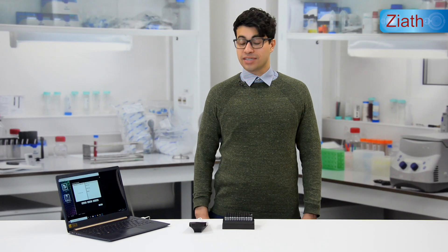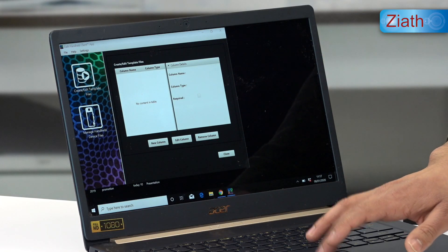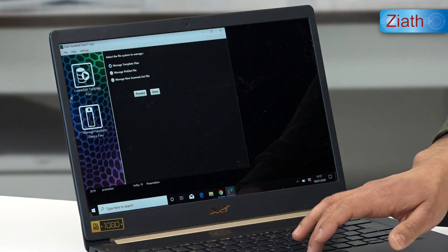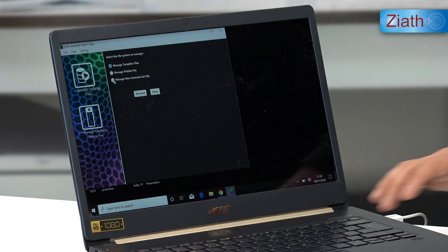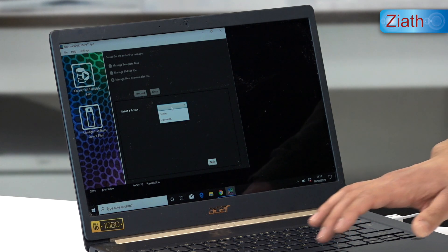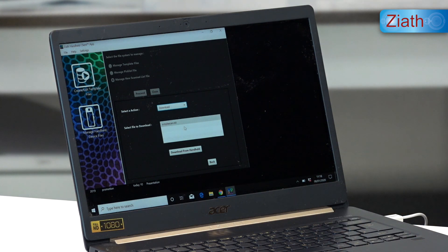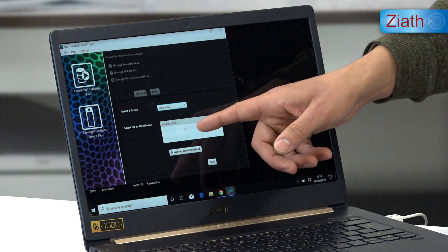We can now plug back into the computer to transfer that list of tubes onto the PC or laptop device. We take the handheld back to the computer and plug it in via micro USB cable, which is supplied with the handheld device. We open up the handheld client application installed on the computer. We can manage the handheld devices, click on manage new scan file, proceed, select an action, download, and the file we created — entitled simple scan — can be seen on screen.